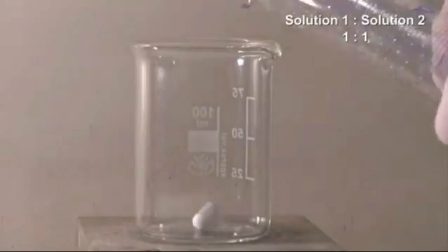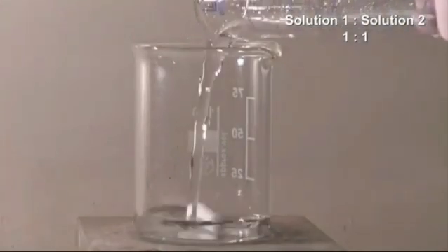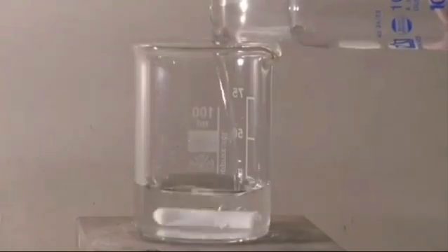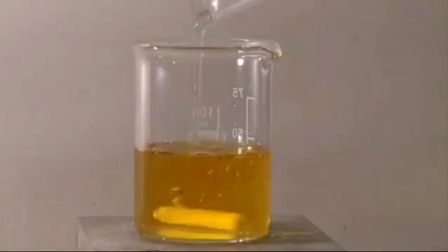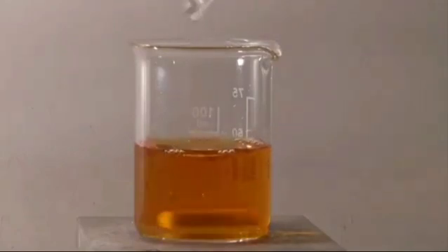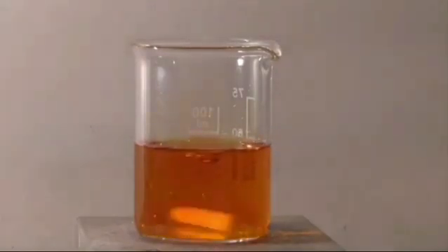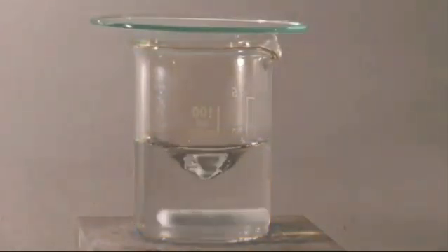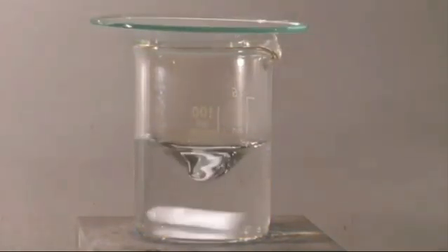Solutions 1 and 2 are mixed in the ratio of 1:1. 25 milliliters of both solutions were mixed in the ratio of 1:1. When the solutions mix, bromine is formed immediately, which slows down the reaction after a while, so it is recommended to cover the beaker with a watch glass.